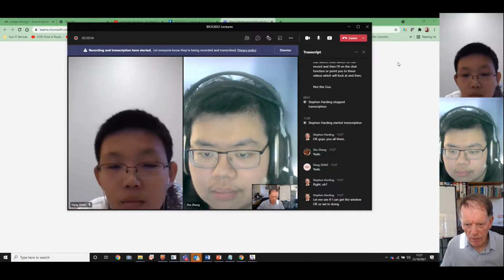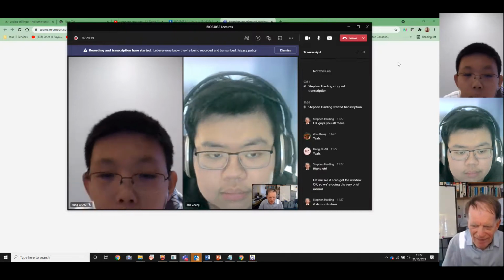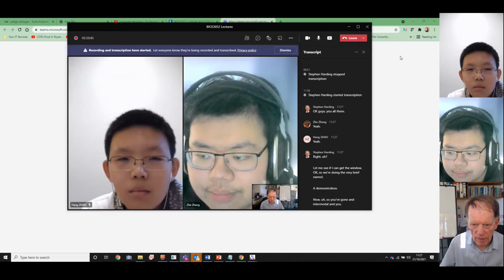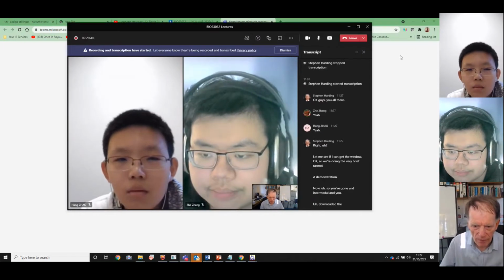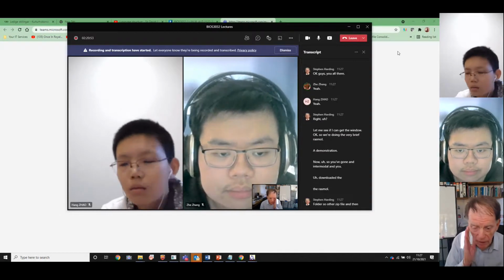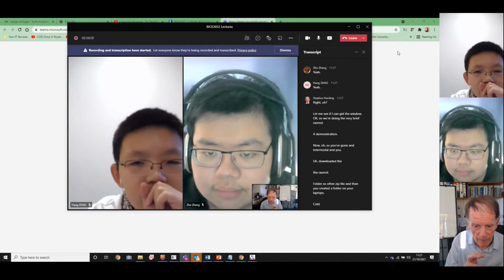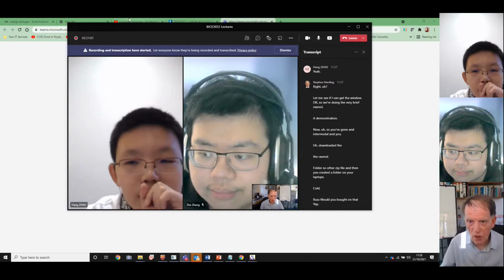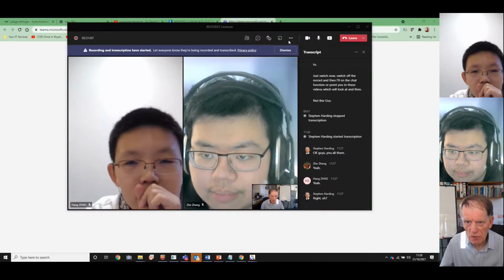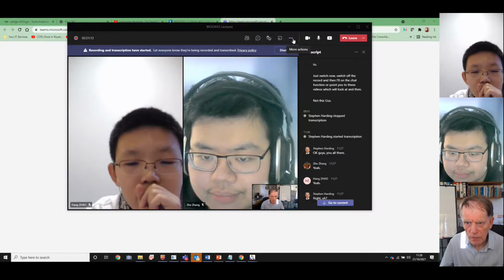Okay, so we're doing the very brief RASMOL demonstration now. So you've gone into Moodle and you've downloaded the RASMOL folder, so the zip file, and then you created a folder on your laptops called RASMOL. You've all done that. Right. Good. So let's see if I can share my screen with the RASMOL stuff on.